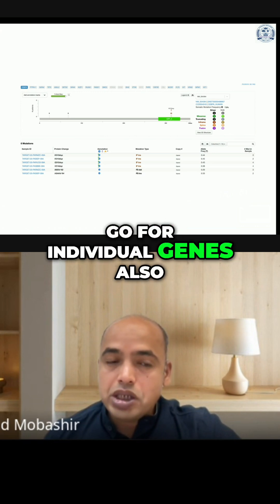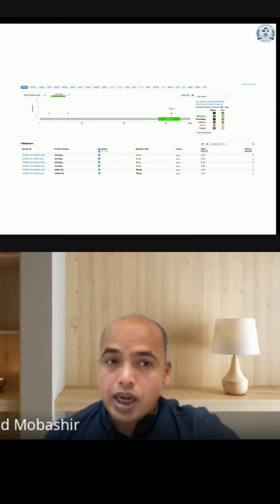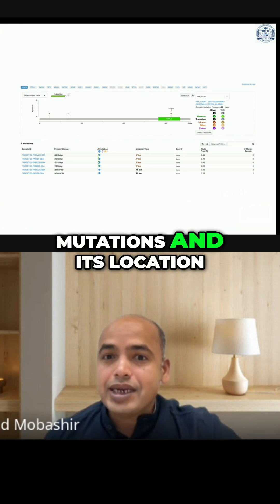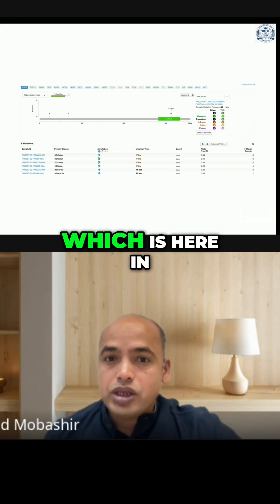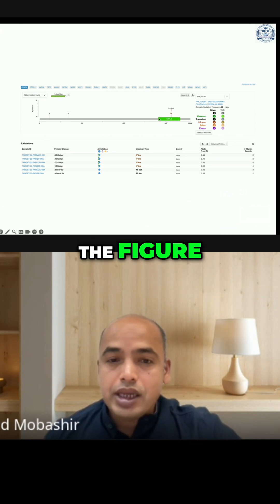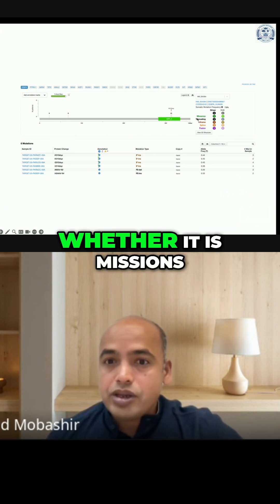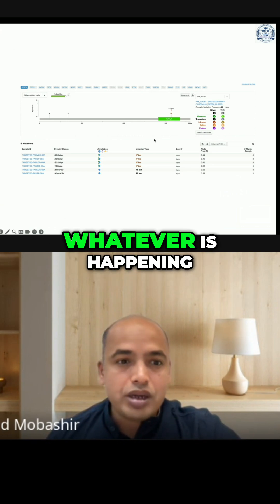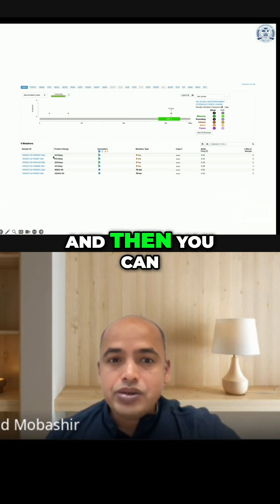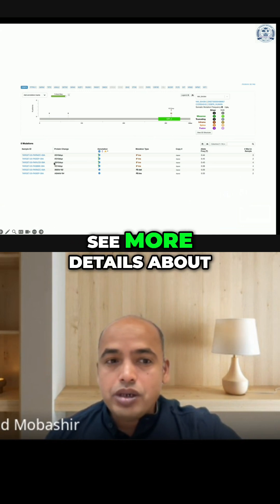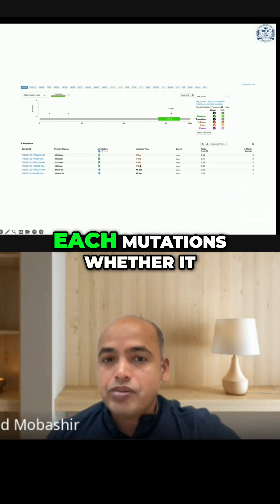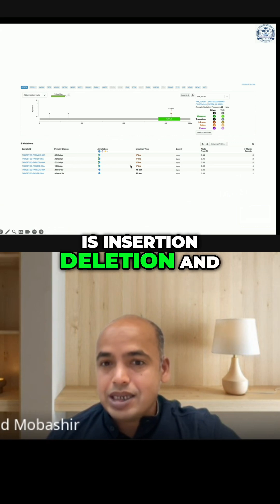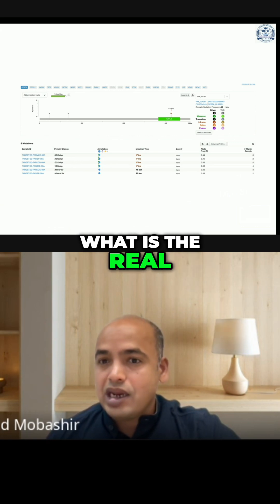For individual genes, click on them and you will see the mutations and their location, shown here in the figure. You can also see the mutation type — whether it is missense, truncating, in-frame, splice, fusion, or whatever is happening. You can also see more details about each mutation, such as insertion, deletion, and the actual frequency.